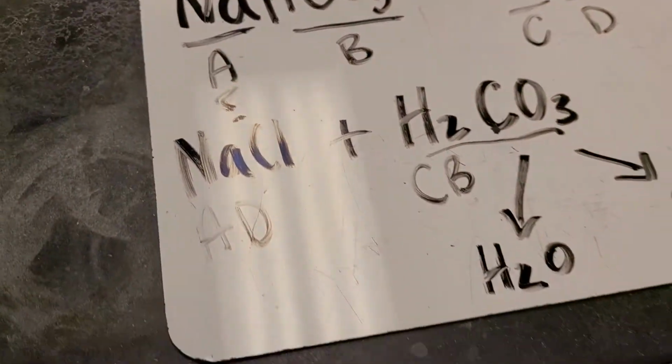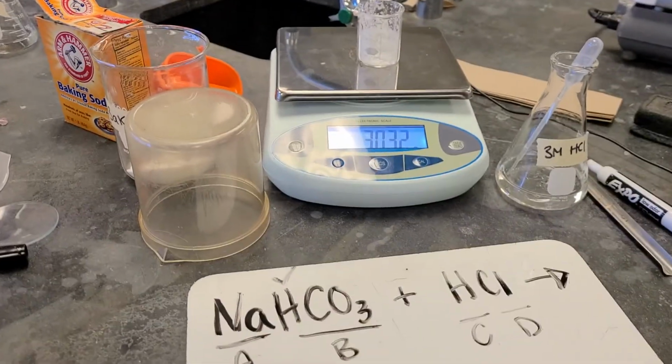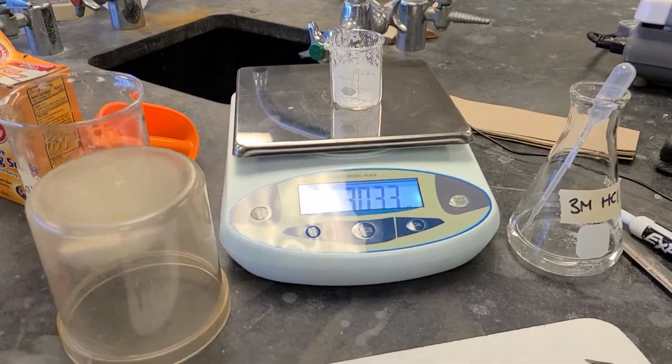There you have it, everybody. The Wow Salt Company Salt Production Lab. So you can record all of the data into your answer sheet and ask questions if you need to. That's all for today.